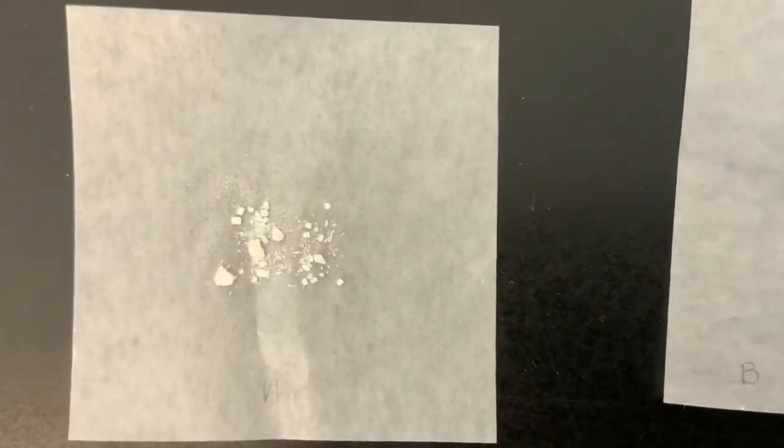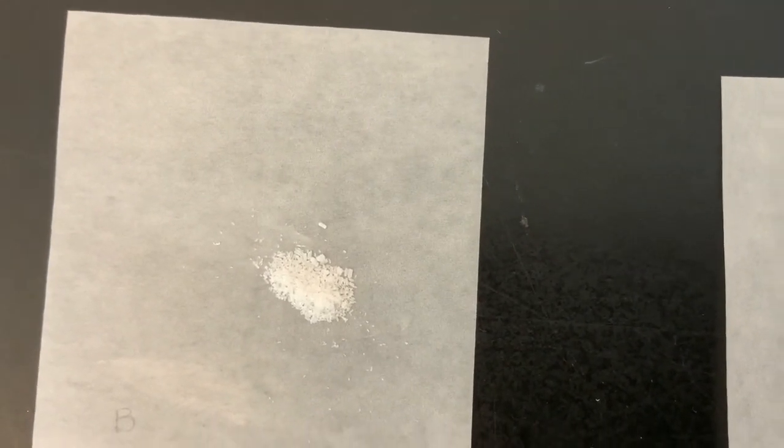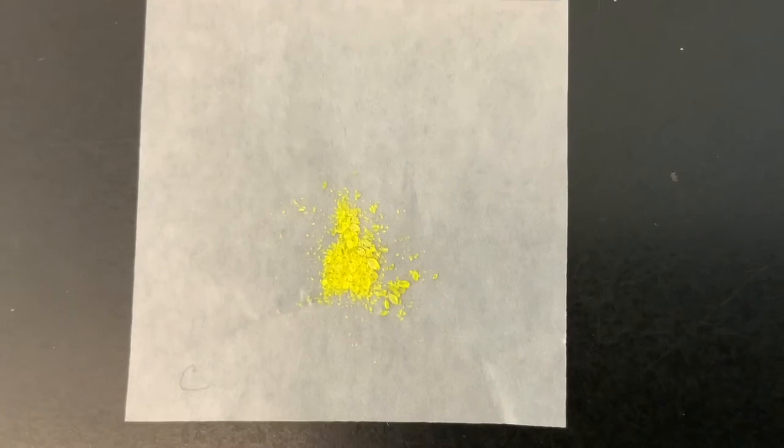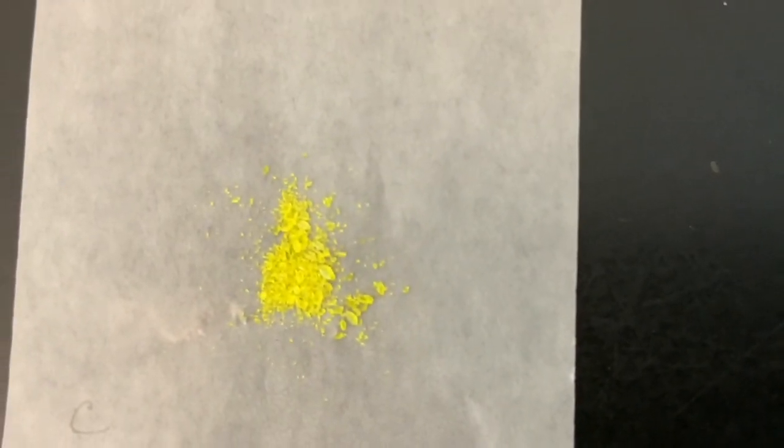This is 51 milligrams of benzoic acid. This is 52 milligrams of benzocaine. And then here, this is 56 milligrams of 9-fluorenone. So we're going to combine it into a culture tube.